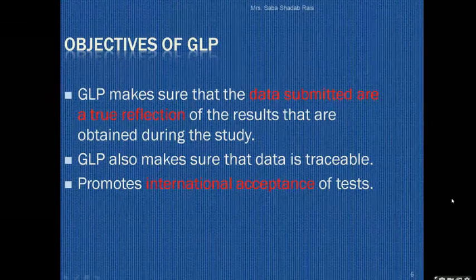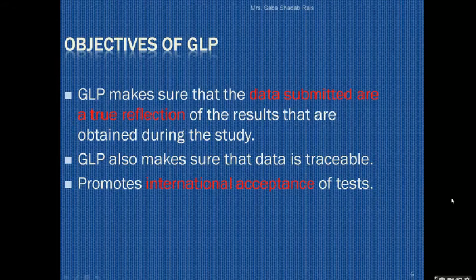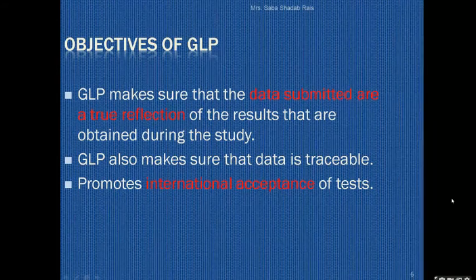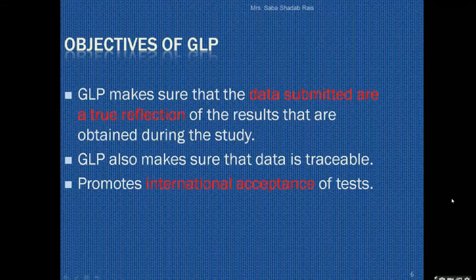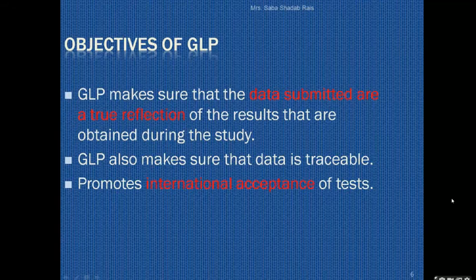In our laboratory also, you will find that after a few years they conduct an audit. Audit is nothing but an inspection kind of thing. So in college laboratory also audits are there, inspection is there. The LIC committee comes, and they observe whether the laboratory has the proper chemicals and all or not. So GLP, what are the objectives?